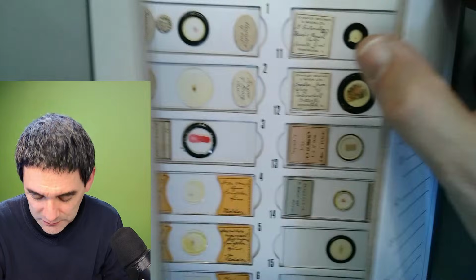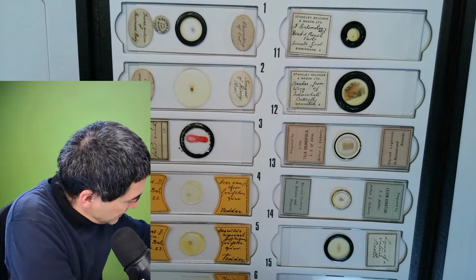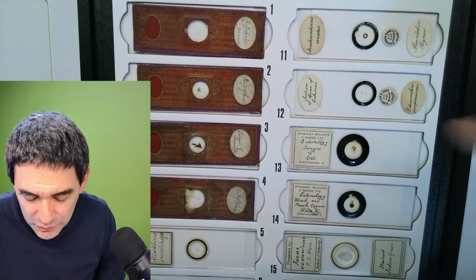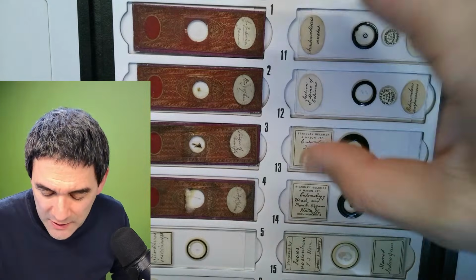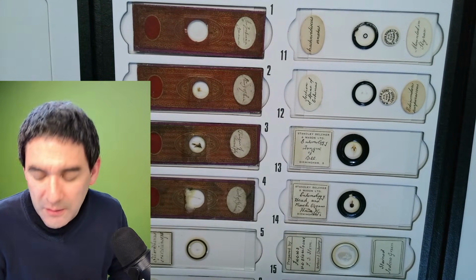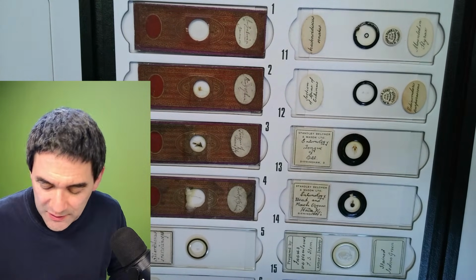Look at this, what I got here. These are some antique slides that I bought. Let me put this one here carefully over it. And look, there are some red paper covered ones here as well. Of course, I don't know. Generally I don't like to touch them anyway. I only touch them on the side, also because of fingerprints. But of course you never know what they've included in those, maybe simply to make them longer lasting. But honestly, these are those antique slides here.